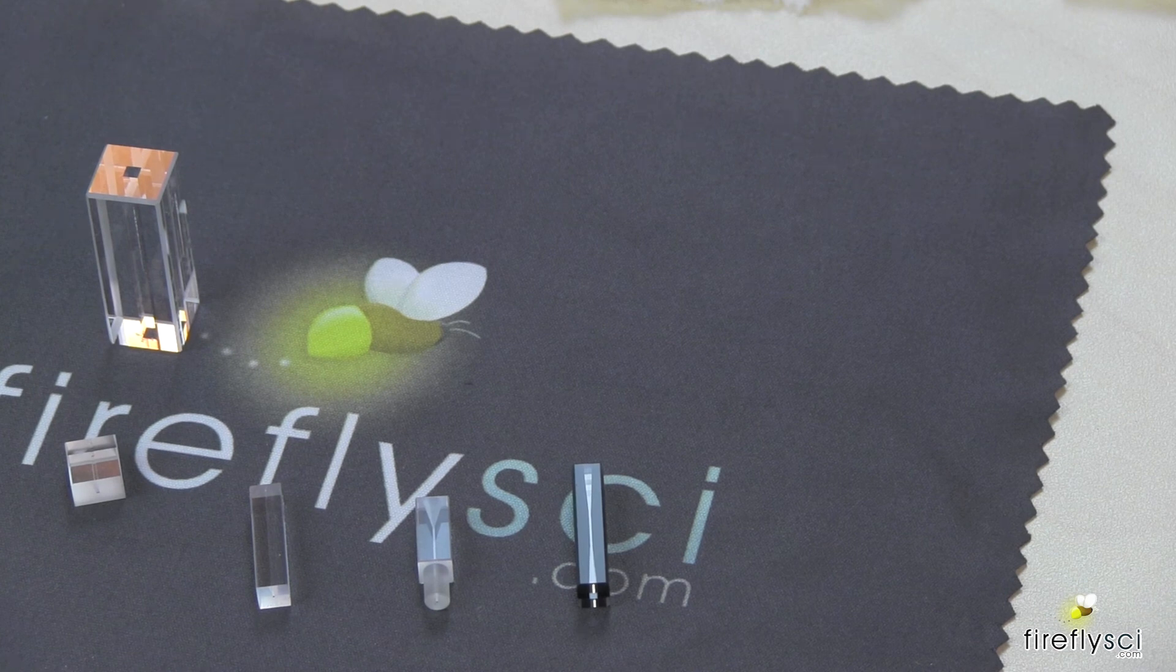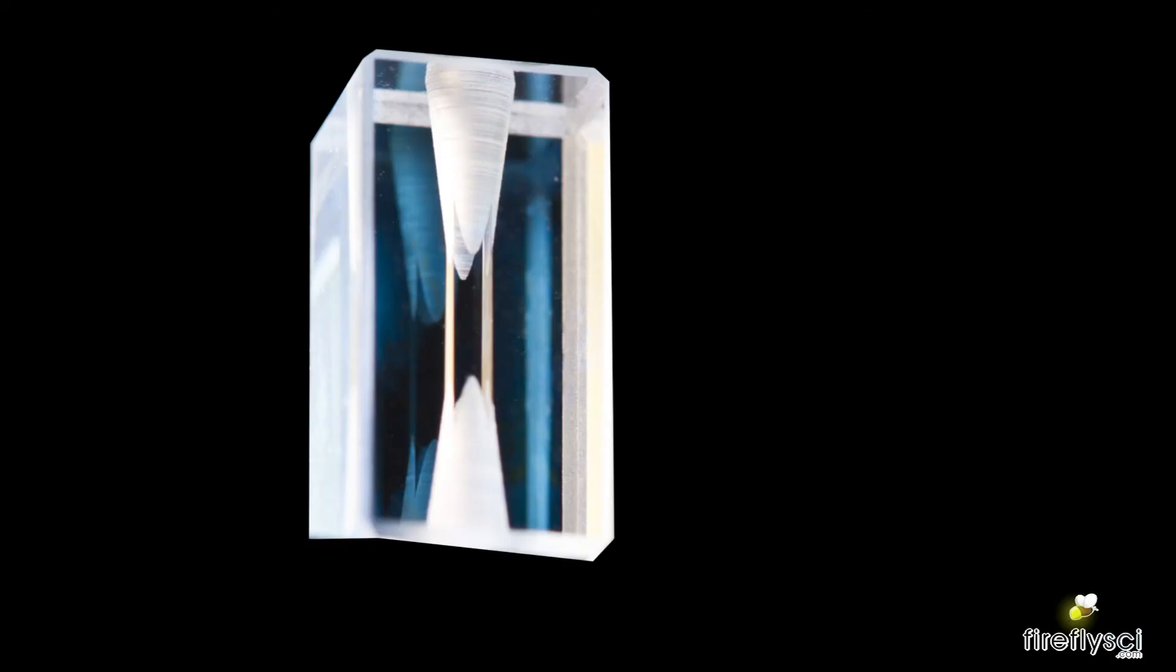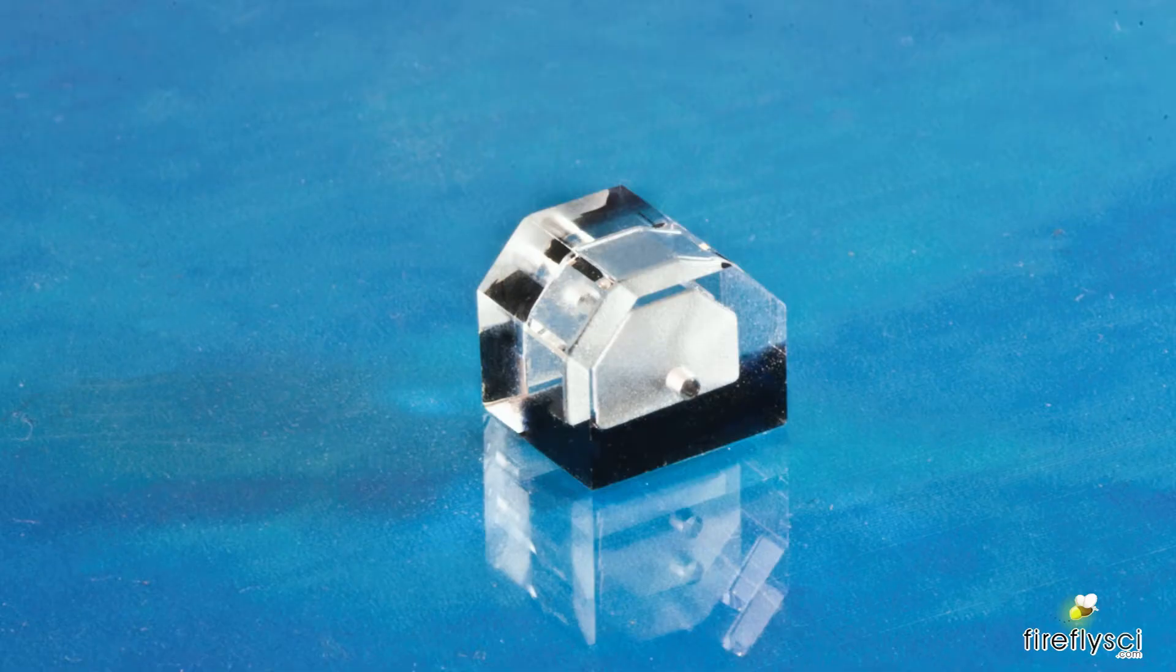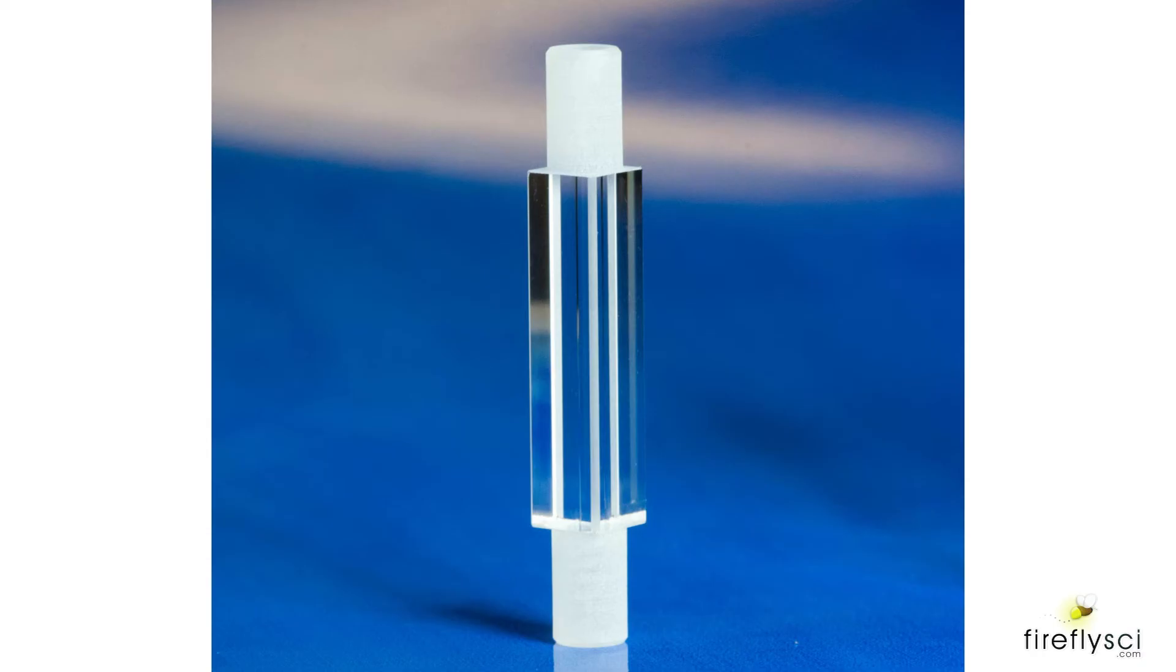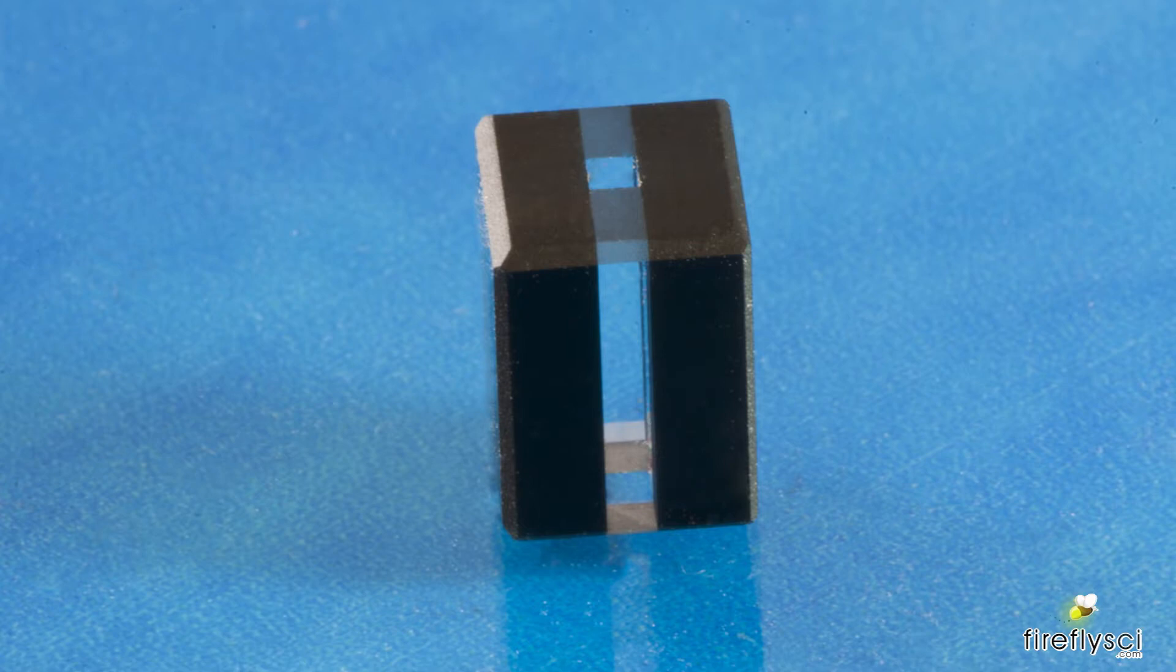So modifications we can make to flow cells are inlet cones, inlet and outlet cones, custom shapes, beveled edges, rounded ends for easy tubing hookup, and designs with clear and black quartz.